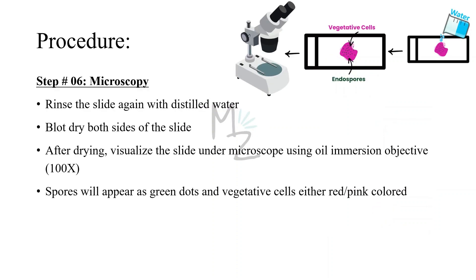Step six, the last step: we'll rinse the slide again with distilled water and blot dry both sides of the slide. Blot dry means to gently remove excess moisture or liquid from a surface using an absorbent material like a paper towel. After drying, we'll visualize the slide under the microscope using the oil immersion objective at 100x magnification. Spores will appear as green dots, and vegetative cells will appear either red or pink colored.